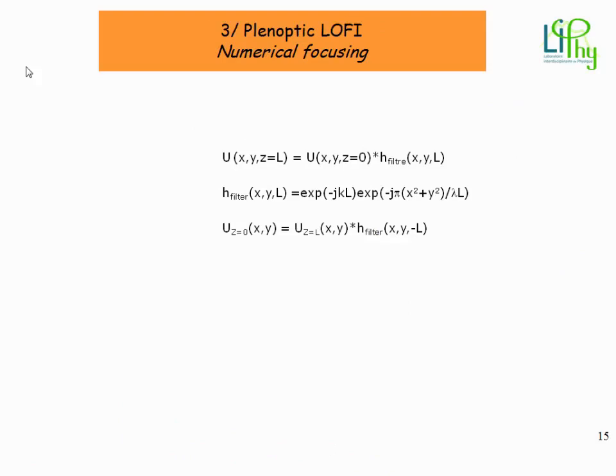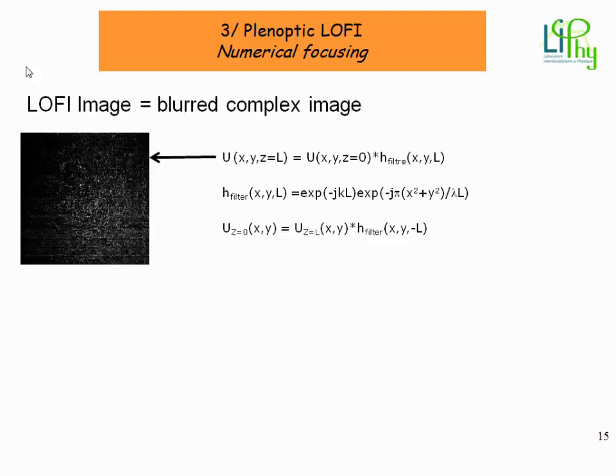So now the third part of this talk is about the Plenoptic LOFI microscope. In fact, the synthetic aperture process, the adapted filtering which is used in the synthetic aperture process, can be simply interpreted as a numerical refocusing of a blurred acquired image. Indeed, the LOFI setup is an interferometric setup which allows us to register point by point, line after line, the amplitude and the wavefront of the feedback electric field, that is to say, the number of photons in each propagation direction.